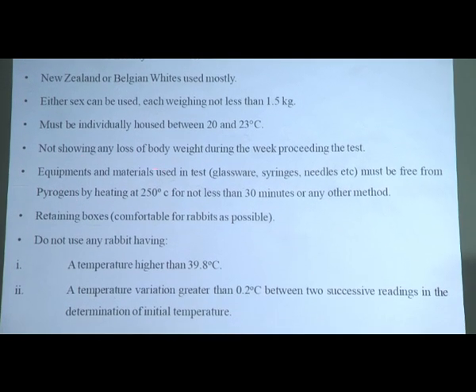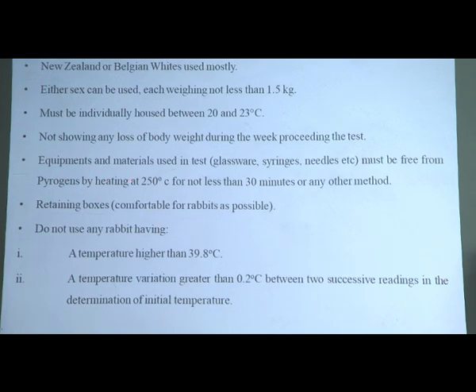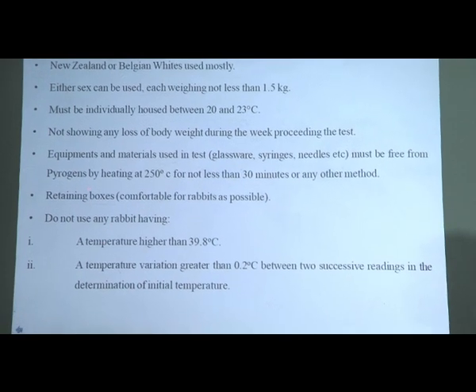If these equipments and materials are not apyrogenic, then they should be made apyrogenic by heating at 250 degrees Celsius for not less than 30 minutes, or by any other suitable method to remove the pyrogens from equipments and materials. Then, retaining boxes.